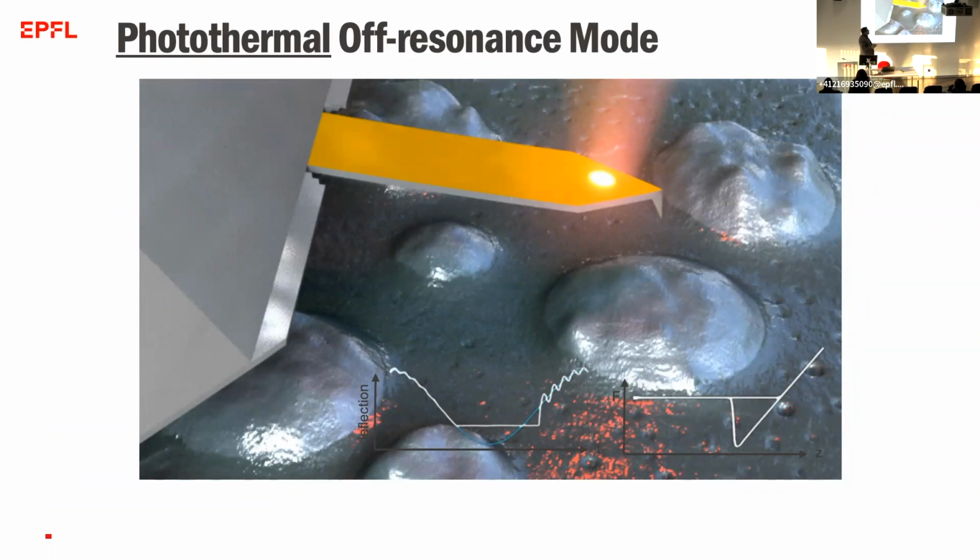And the clever thing that some of the students did was that they said, well, it's very difficult to physically move the probe to each data point, move it away, go back in and measure. That takes a lot of time if you do it physically with motors or piezos or stuff like that. But what's very fast is to operate diodes, laser diodes, light sources.